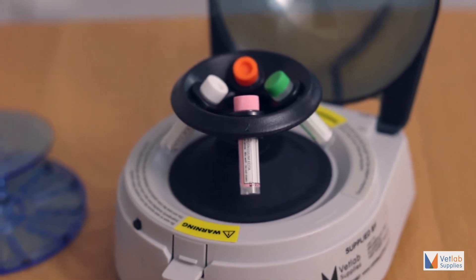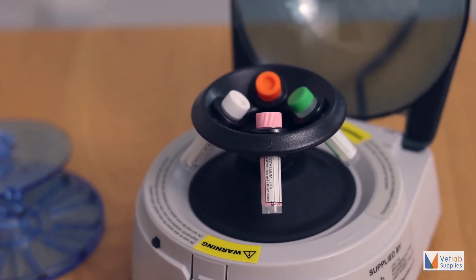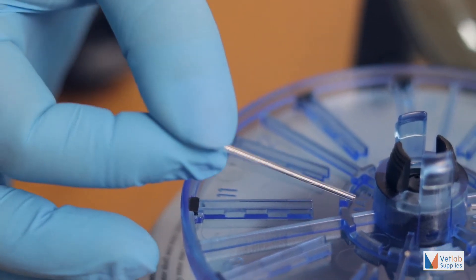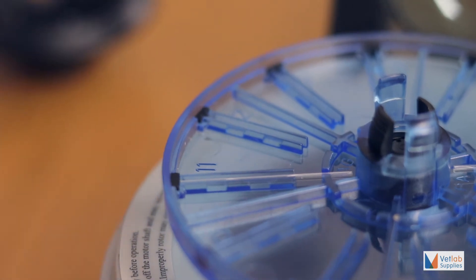A variety of capped plastic blood tubes can be accommodated from 0.5 to 2 millilitres, as well as 40 millimetre micro hematocrit capillary tubes.